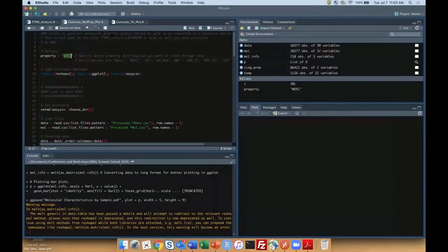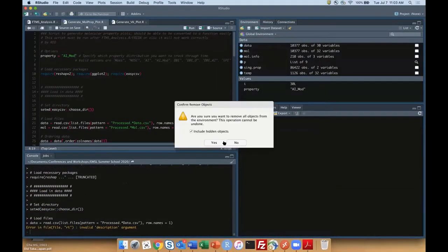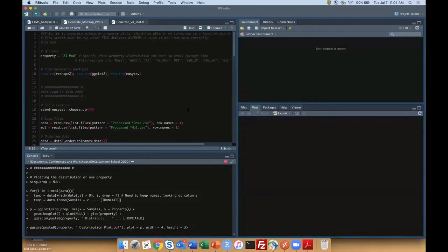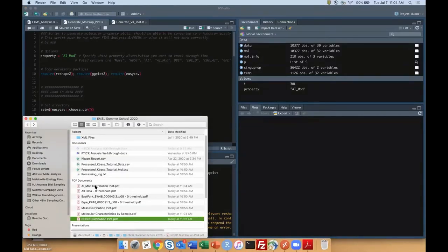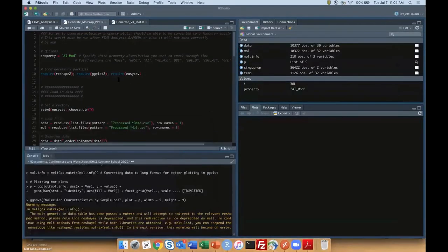Because again, we can change this to something like aromaticity. Yep. Seems to be 2 is the limit. And then I just generate another one for aromaticity. And you can see again, distribution-wise, there's variability, but average really would exacerbate that in some ways. And again, median might be more important than average anyway. It's all about research questions. It's all about research questions.